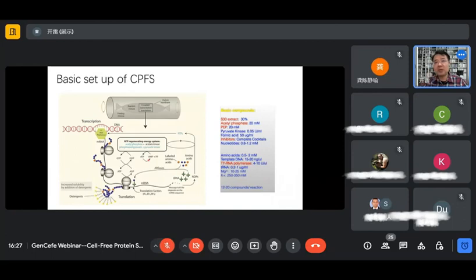The best known are phosphoenolpyruvate, acetyl phosphate, and creatine phosphate, which all have a high-energy phosphate bond that can regenerate ATP in a single reaction, coupled to a particular type of kinase. And of course, there are different additives that you can choose to include in the cell-free system. This is highly diverse, depending on individual cases.